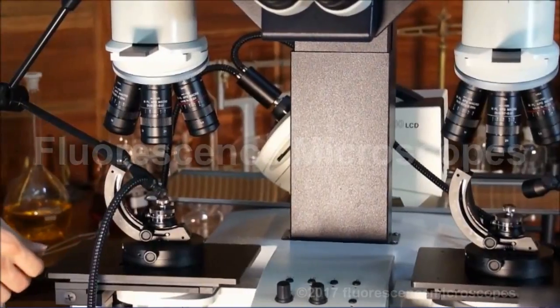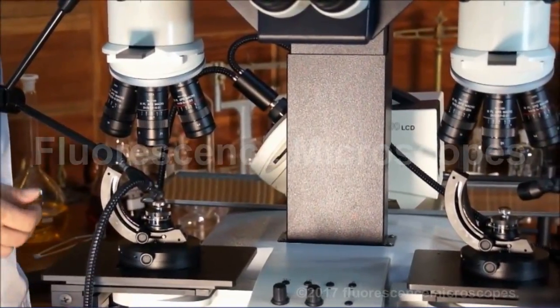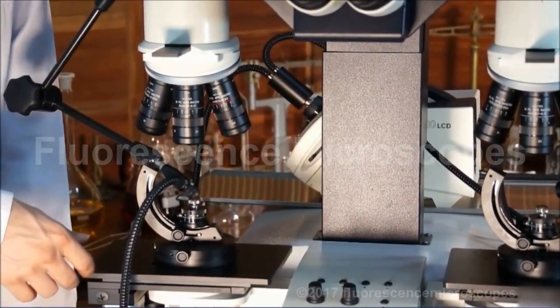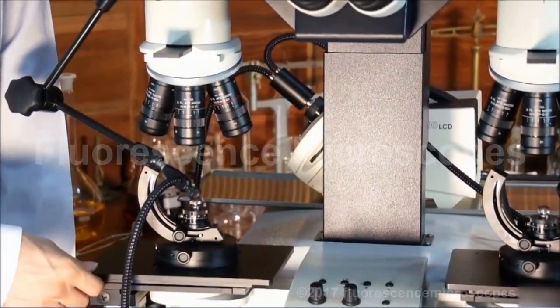This is a current model line from Leica. So any parts that you need, any of the optional accessories that you'd like to buy can be purchased from Leica.